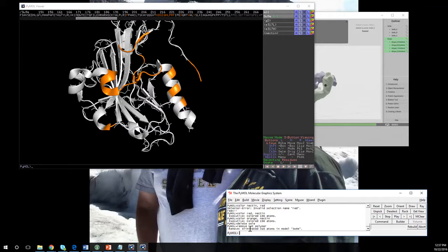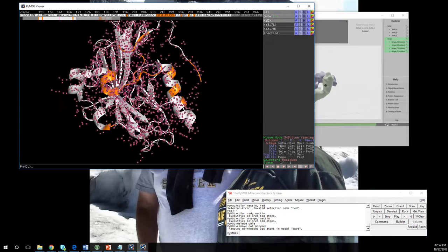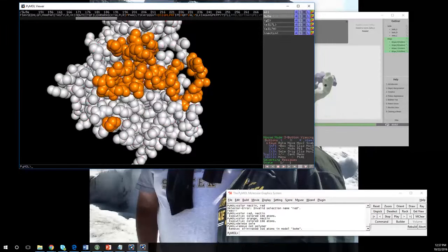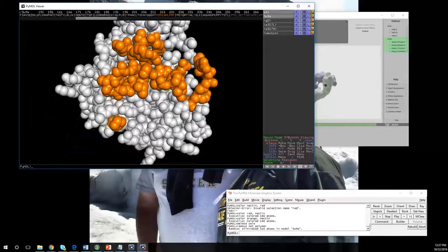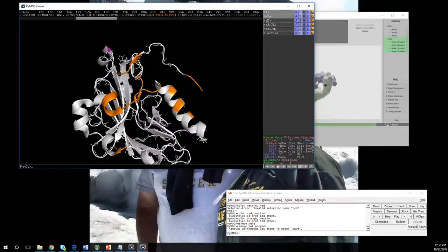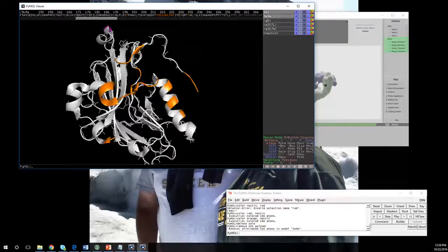And I can zoom and identify the functional groups, as I mentioned earlier. If I put on a sphere on here, I just did hide. If I do spheres, I'm going to hide a whole bunch of stuff. If I hide that sphere, all of a sudden I've got a nice little diagram here, and I can look at it.